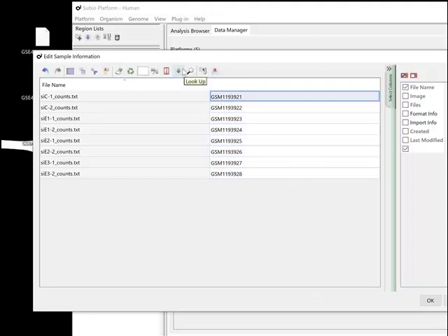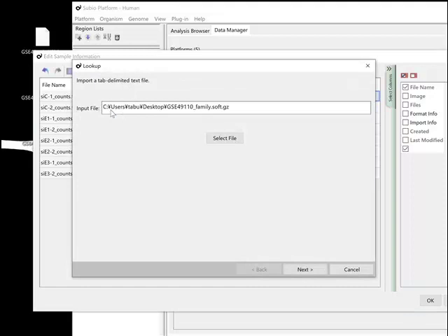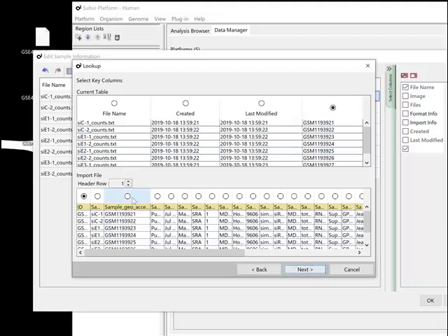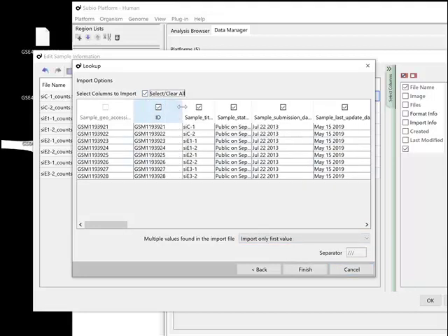Use the tool to import the SOFT file you downloaded. Select a column containing IDs to connect the upper and lower tables. Select columns you want to import and click the Finish button.